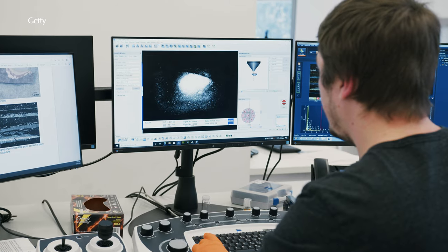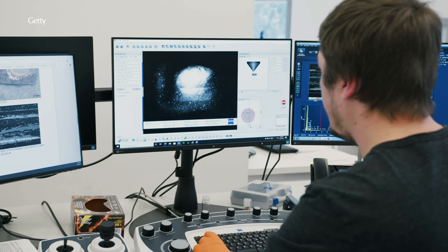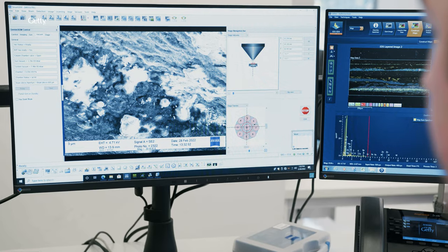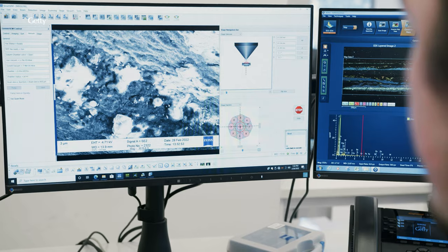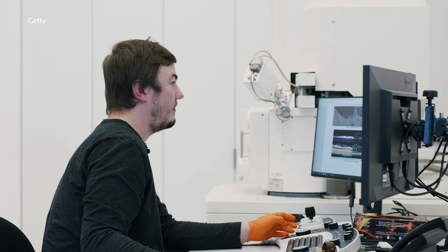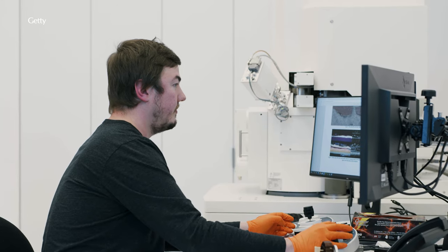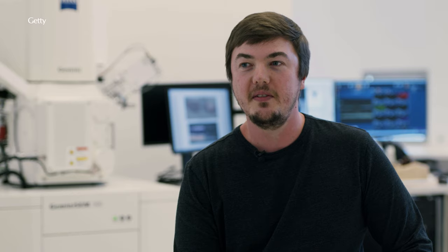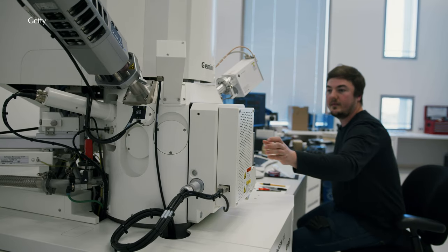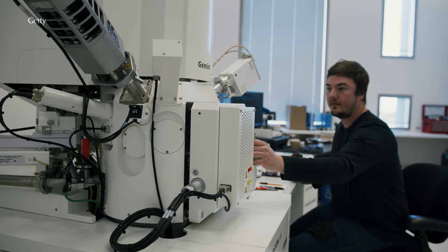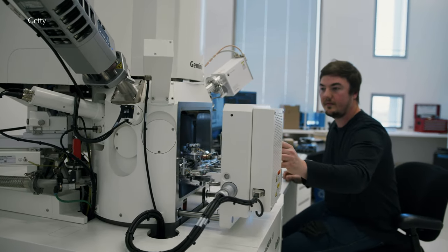It's our job to figure out what those materials are and what implications their use might have on the conservation, exhibition and longevity of the artwork. One of the main ways we identify materials in a contemporary artwork is through the use of a scanning electron microscope.